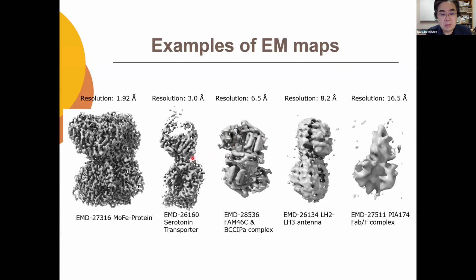So in our lab, we apply many AI-based methods, like deep learning, to be able to get more information from the cryo-EM map of lower resolution, and then try to get the structure information from medium low to low resolution images. So I'll show you several tools we have developed, which is suitable for several different ranges of the resolutions.